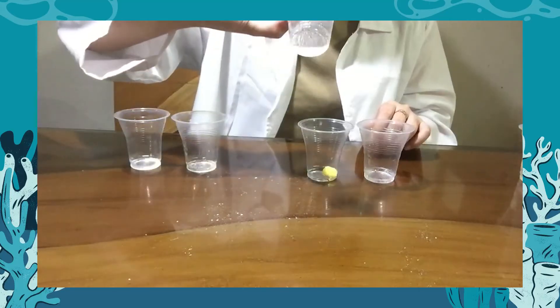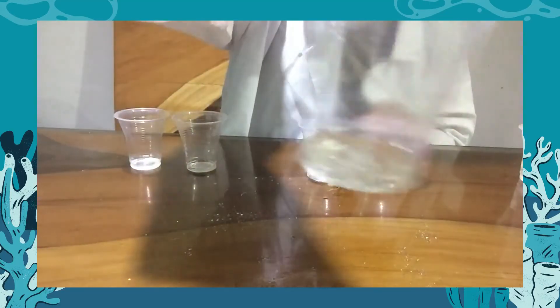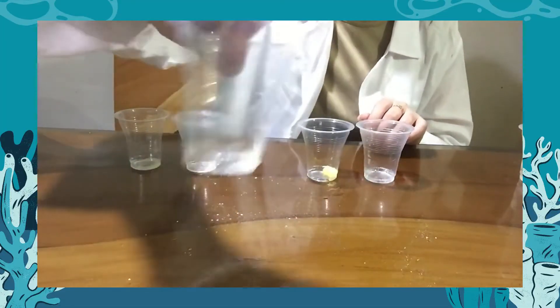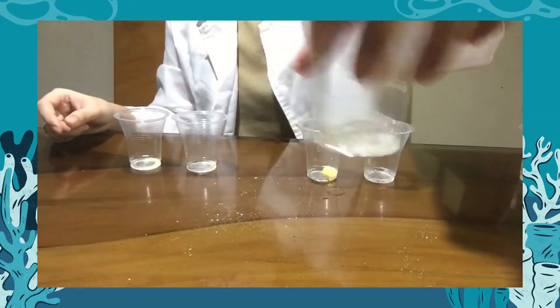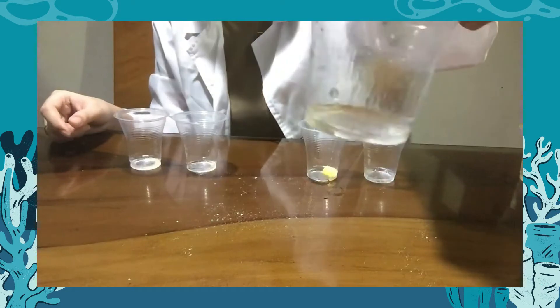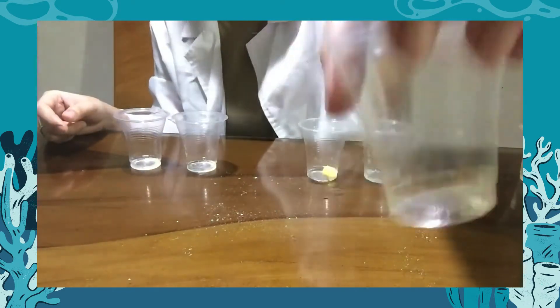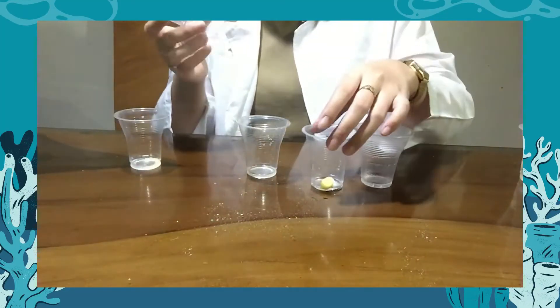We shake the sodium chloride and water mixture vigorously. We can see that most of the particles of the sodium chloride dissolved in 1 ml of water. After shaking a little more, we could no longer identify the particles of sodium chloride — therefore it dissolved in the water.